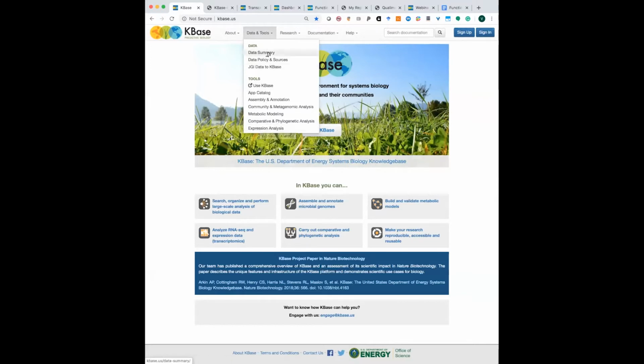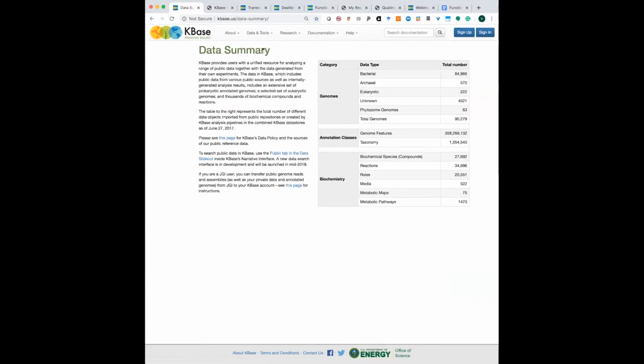And for the rest of the data, for example in terms of genomes, there were some questions about fungal and bacterial genomes. We do support bacterial, archaeal, and a number of eukaryote genomes. I'll also quickly take you through the data panel where we have those genomes. We also have some sample data for reads and genomes that you can play with if you don't have your own data.